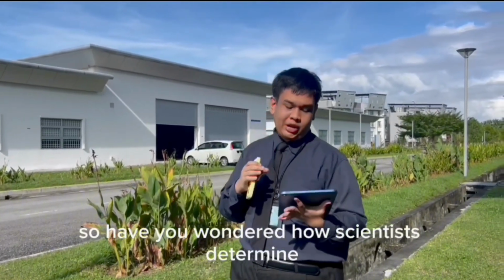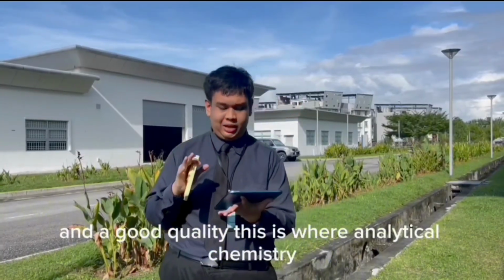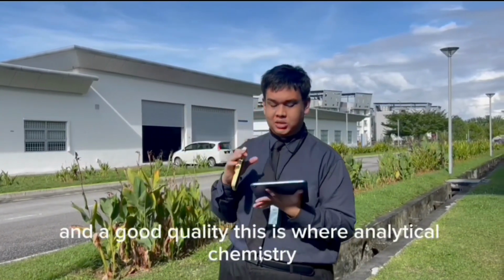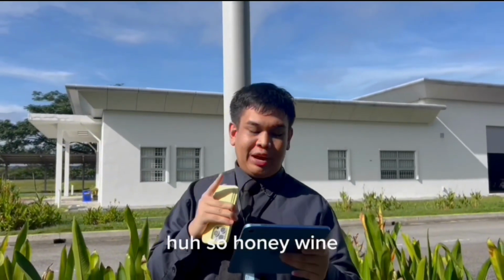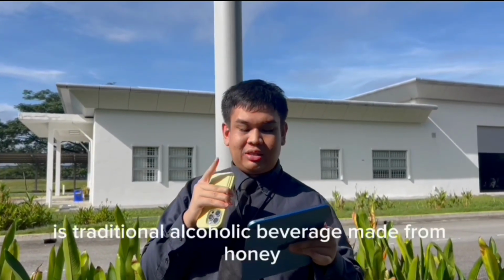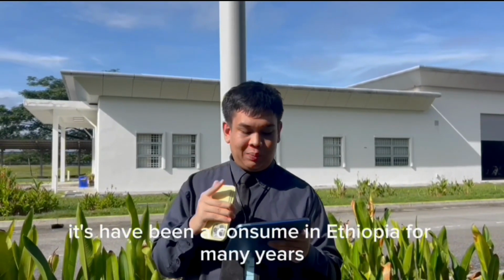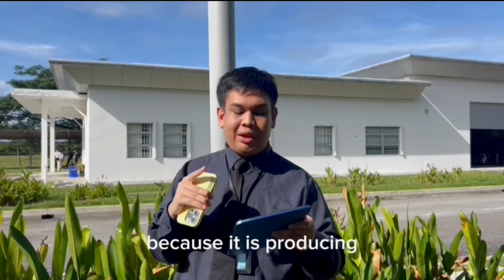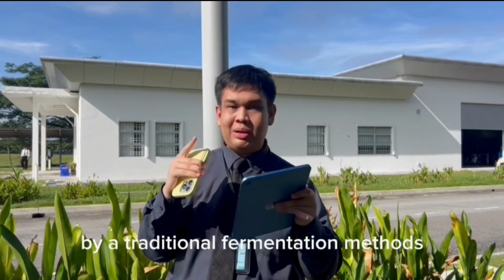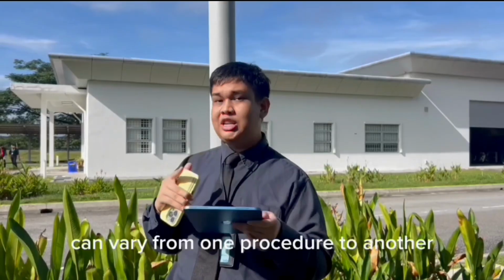Have you wondered how scientists determine whether a fermented beverage is safe to drink and of good quality? This is where analytical chemistry plays an important role. Honey wine, also known as mead, is a traditional alcoholic beverage made from honey, water, and gesho leaf. It has been consumed in Ethiopia for many years during cultural and religious celebrations. However, because it is produced by traditional fermentation methods, the quality and safety of the beverage can vary from one procedure to another.